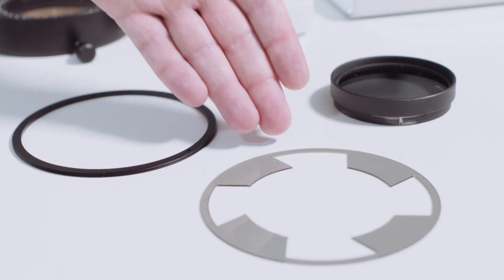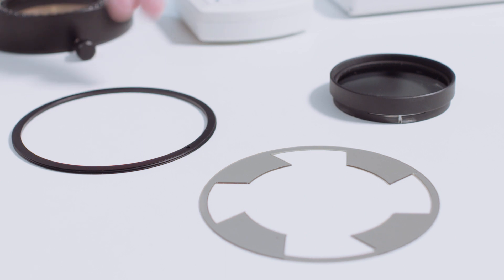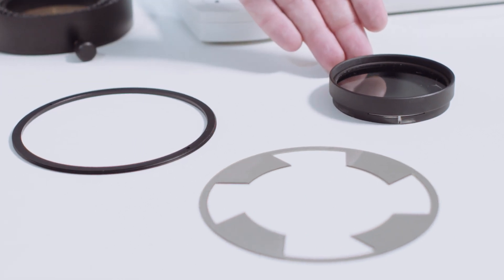The set consists of the segmented polarizer, a mounting ring for the polarizer, and an analyzer that can be plugged in.